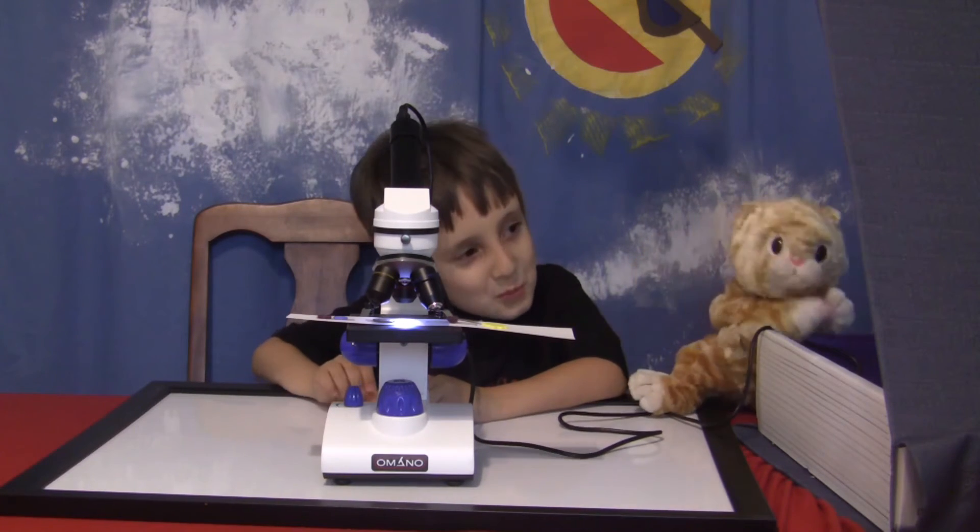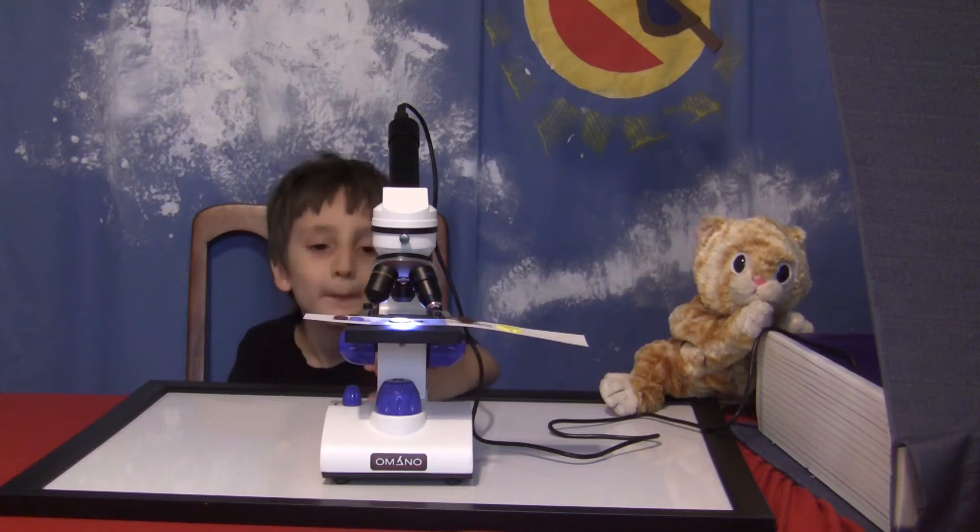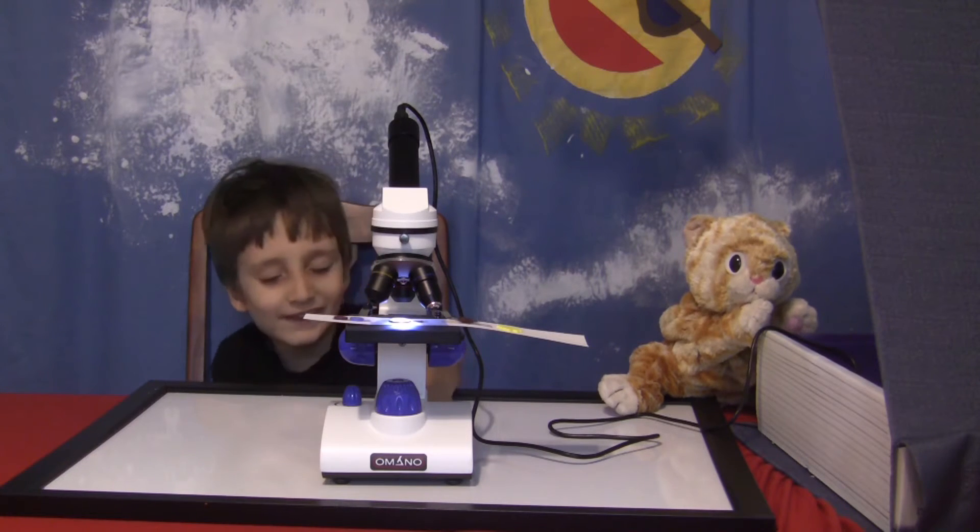I'm sure glad that the magic book isn't eating anything. Wow, that's the metal. That's the metal. Look. Neat. It looks like an alien planet. Doesn't that look like space? Yeah, it looks like we put it in the telescope. I like it.